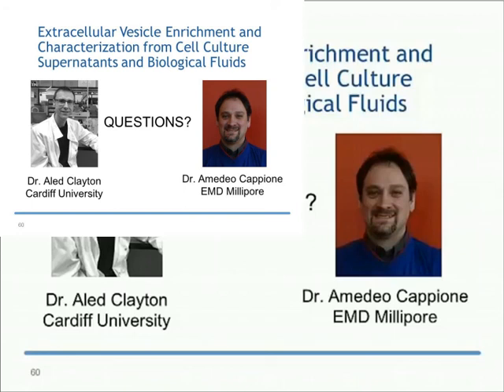Yes, you will. Well, I guess depending on what your method of purification is, if you had some sort of affinity-based purification where you could specifically pull out your vesicle of choice, then I guess it might not be an issue. However, in any of the other methodologies where you're basically separating on the basis of size, the presence of vesicles in your serum is going to cause some issues with understanding the purity, understanding the count number that you're able to recover.